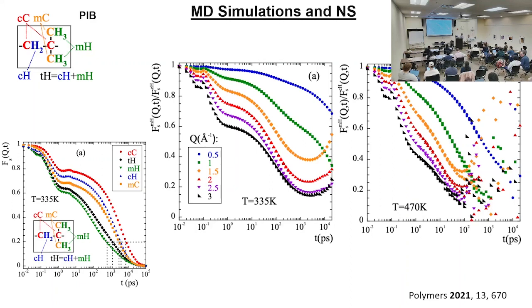But did the authors just get this result and were they able to see it with the resolution they had? For anyone, in general? Usually what you do is, if you measure, for example, on backscattering, and you realize that you have signs of a slower process, then you will go to neutron spin echo, right? And if you think that there is something fast, then you need to go to time of flight. Now, in time of flight, you can tune the instrument resolution by choosing different wavelengths. So you have freedom. Now, how do you choose a particular one?